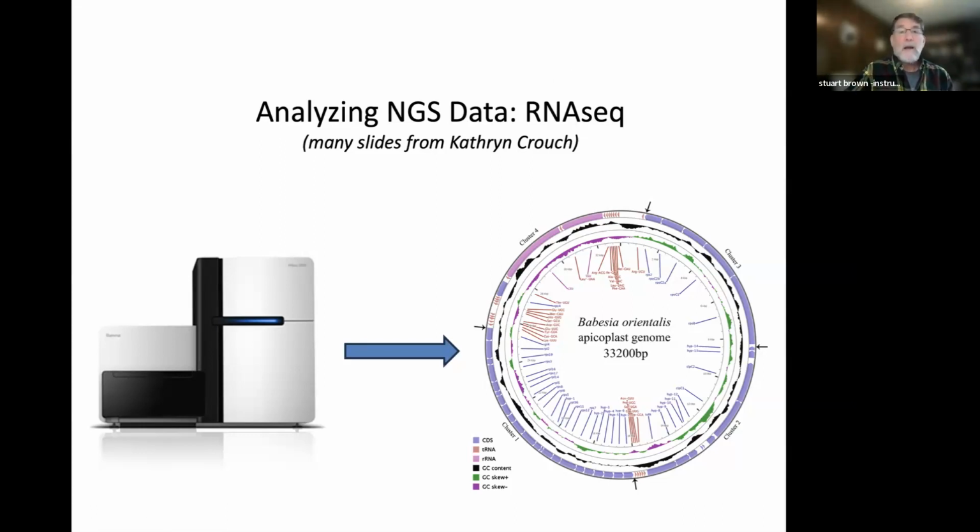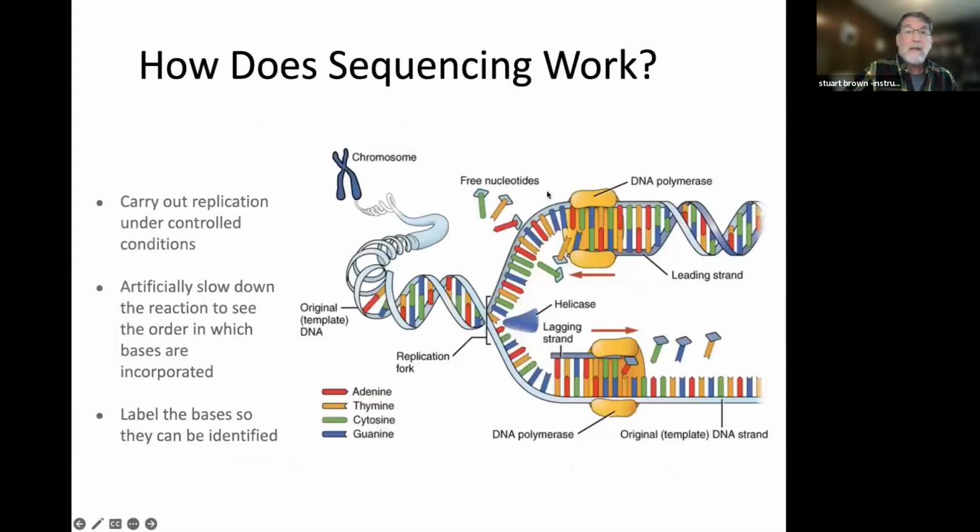So I wanted to start by talking a little bit more about DNA sequencing, because RNA-seq is a DNA sequencing application, and some of the QC, some of what we're trying to make sure worked well, is directly related to how well the DNA sequencing worked and how well the sample prep worked.